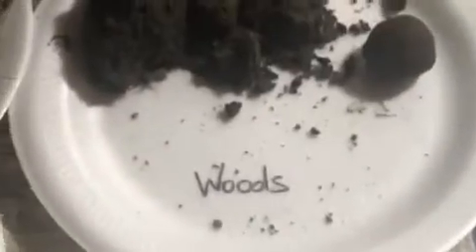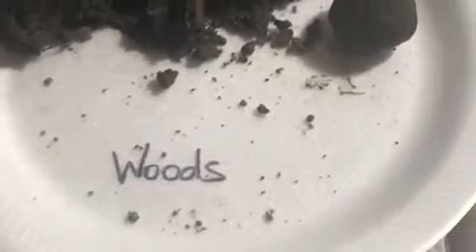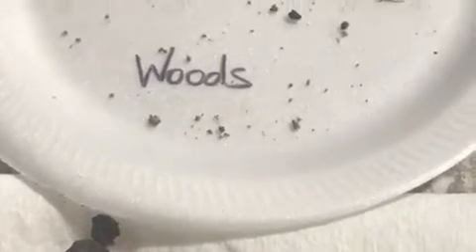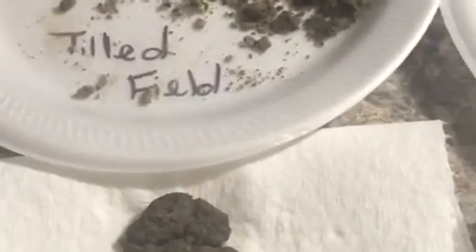where the clods hold their structure, showing that the aggregates or the sediments, the aggregates within the wooded area are less prone to erosion compared to the one from the tilled field.